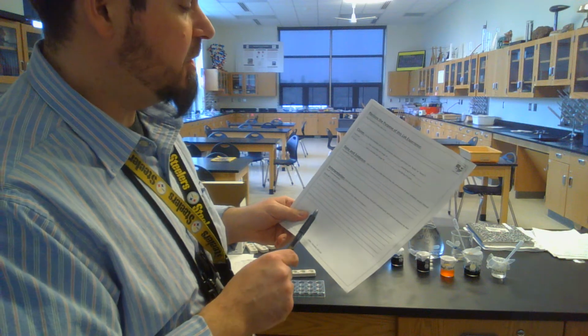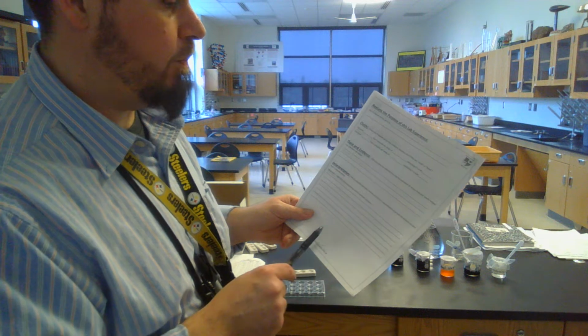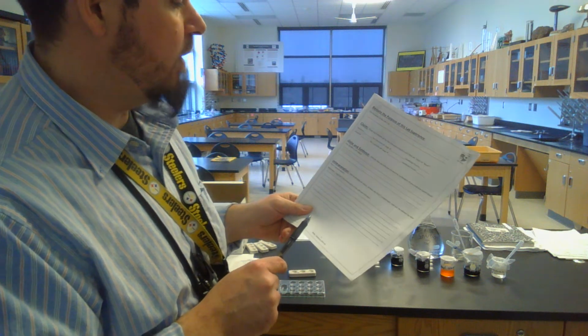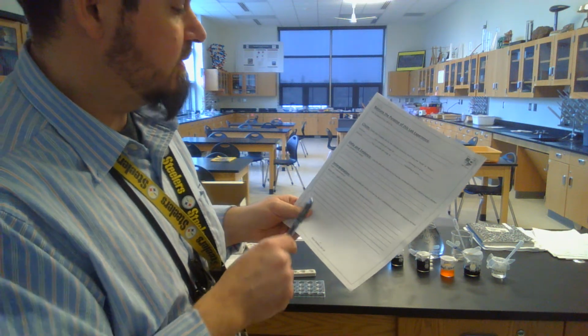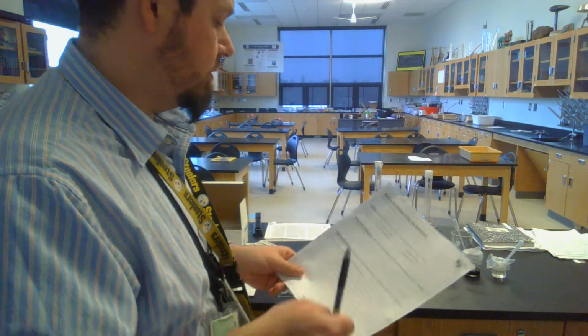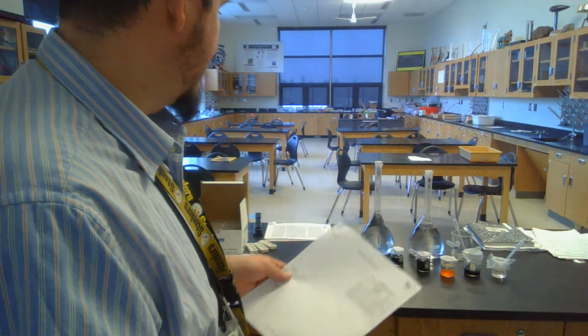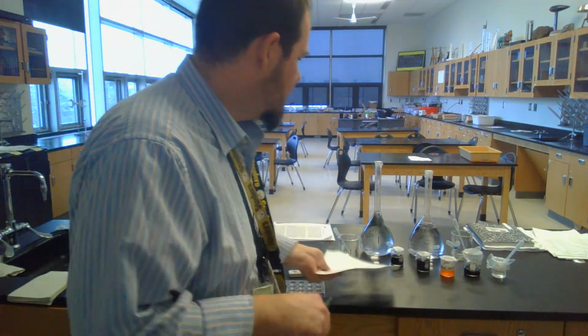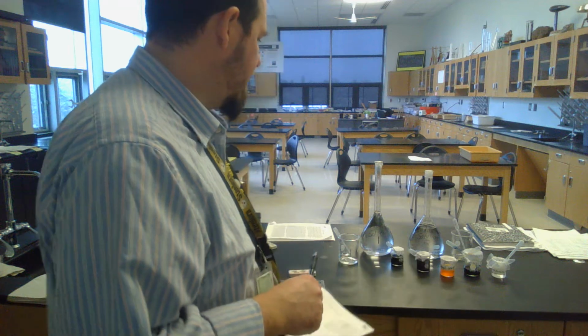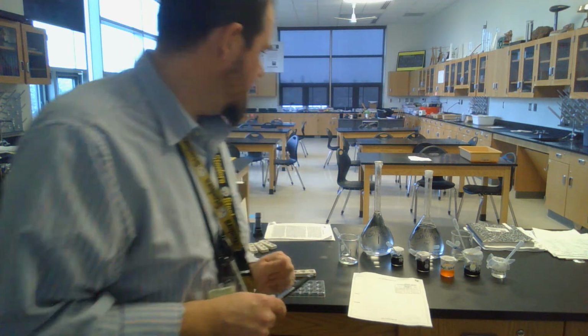Then the interpretation, use the possible pH values to estimate the H plus concentration and rank your solutions by their concentration. Which one has a higher pH, solution 1 or solution 2? Okay, that is the indicator lab. It's kind of cool. I hope that you get to see some of these indicators change colors and get a feel for what's what and how to use these indicators.